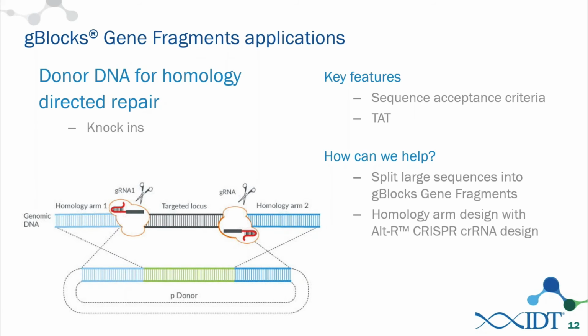Does IDT expect to be able to synthesize more complex sequences in the future? Well, I assume by more complex sequences that he's asking about higher GC content sequences, which are often less complex. That's one of the problems we run into with high GC content is along with just high GC, you also tend to have more repeat sequences and things like that.